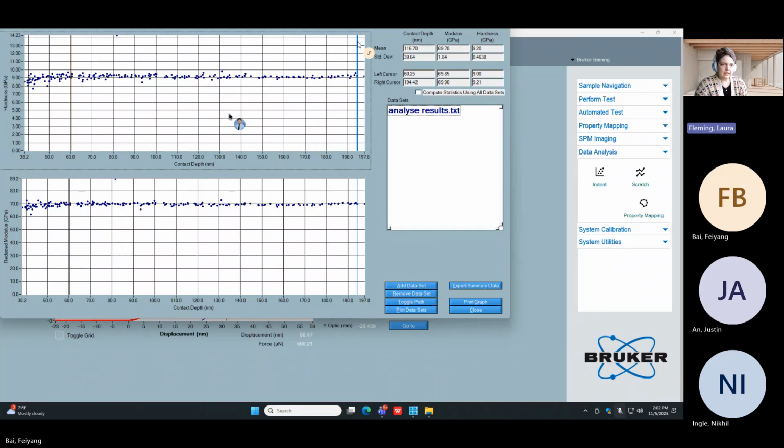If they are good at the contact threshold that you intend to test to in your sample, then you can be confident that the tip area function is correct. If they're not, then you're going to have to run the 100 indents. If you are targeting those lower depths, you will need to go to lower forces on the fused quartz standard to make sure that you're getting this. Any data basically underneath 38 in your sample, I wouldn't be able to trust because we didn't define it well there, and I have no way of knowing what that tip area function is doing at that point.